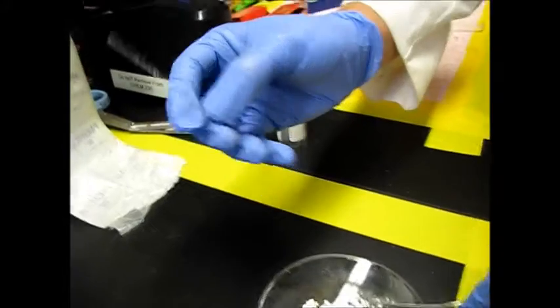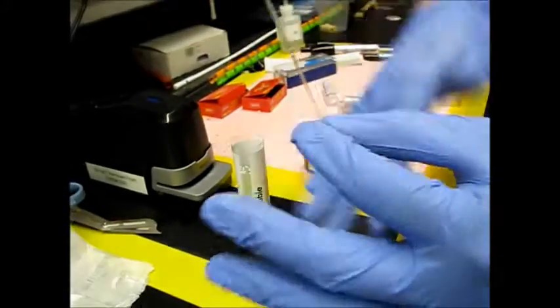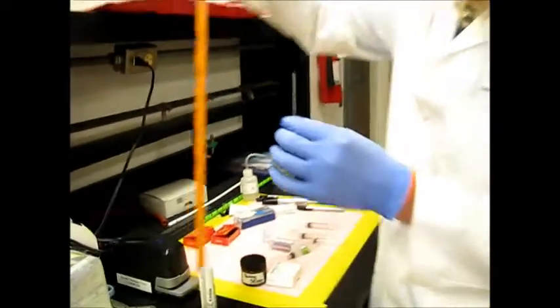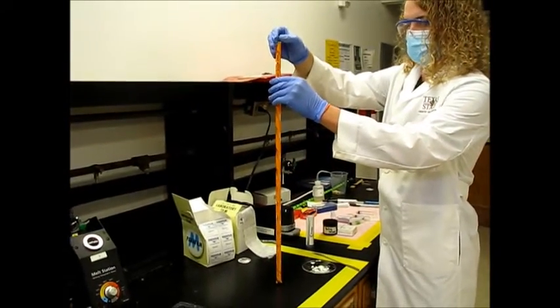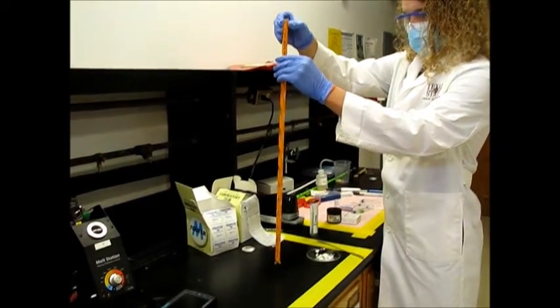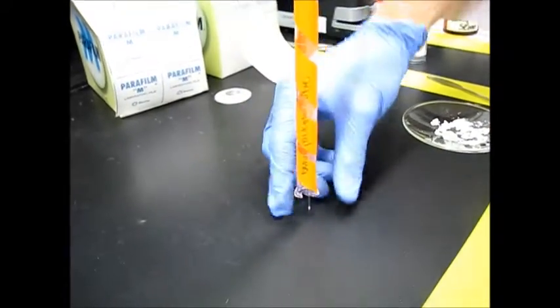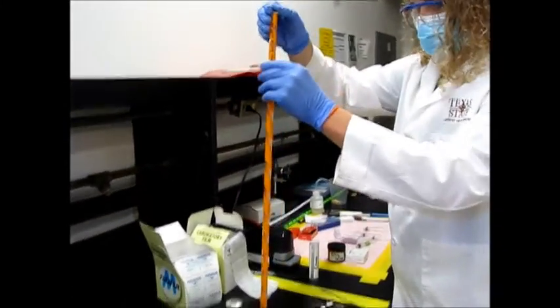Cool. So once you get a good amount, we're going to go ahead and use an old burette to bounce all of this stuff down to the bottom. The way we do that is hold this up here, and we're going to drop it in at the top. That kind of helps force everything down to the bottom. Looks like it's mostly down there. We're going to go one more time.